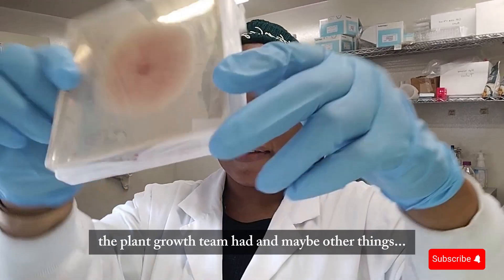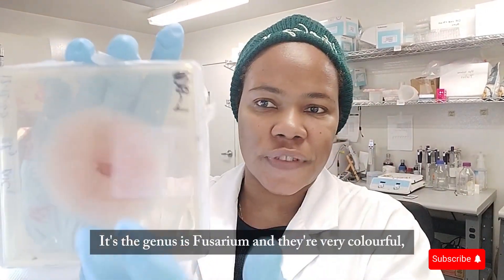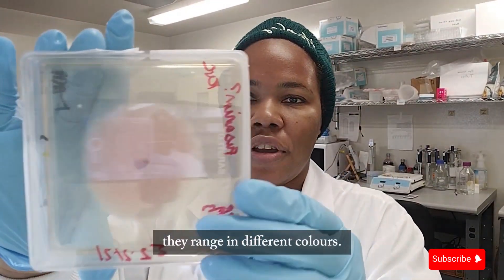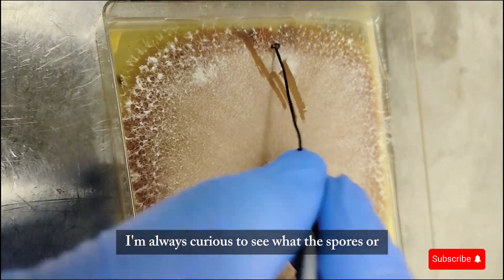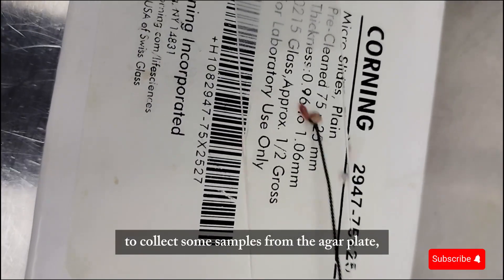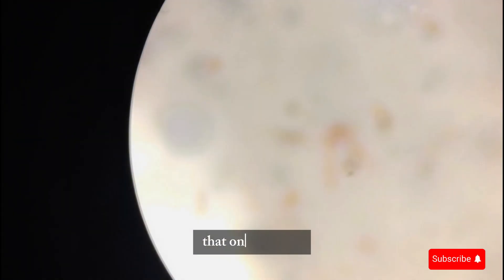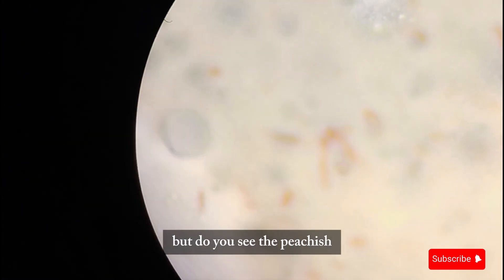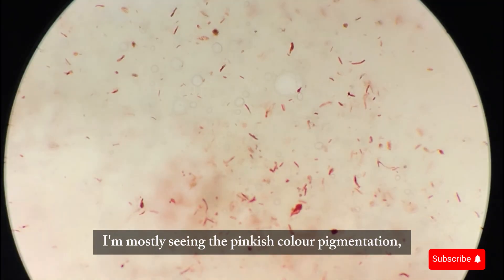I think it's Fusarium — the plant growth team had it, and maybe other things, but this is definitely some sort of Fusarium species. The genus is Fusarium and they're very colorful, ranging in different colors. I'm always curious to see what the spores or cells look like under the microscope, so I'm using an inoculating loop to collect some samples from the agar plate and put them on a slide. You can see the peachy-pinkish colors in the hyphae — I'm mostly seeing the pinkish pigmentation, and I think I have some spores too.